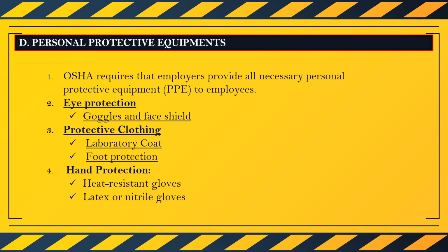So next we have hand protection. Heat resistant gloves: we are using heat resistant gloves when handling hot or cold objects, and latex or nitrile gloves to prevent exposure to biological hazards.